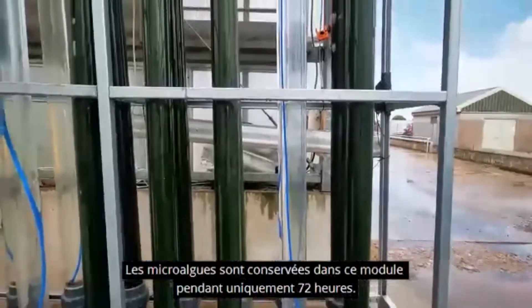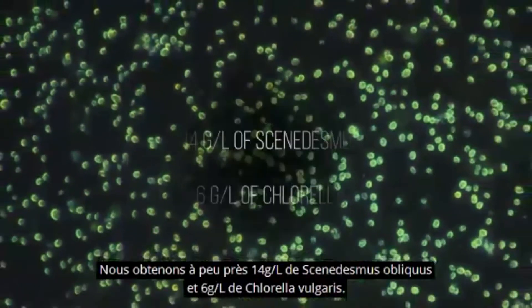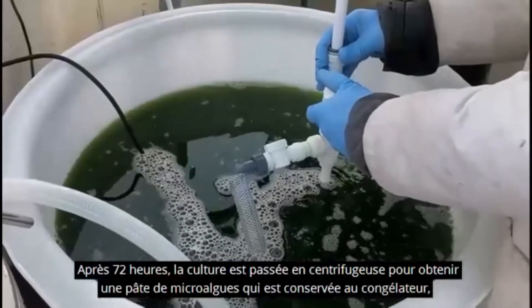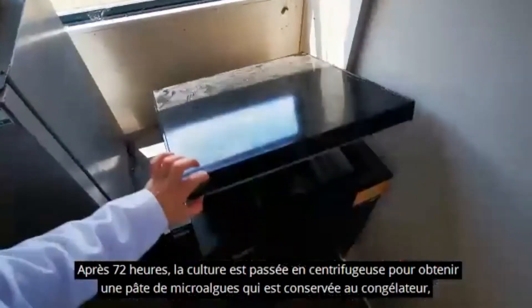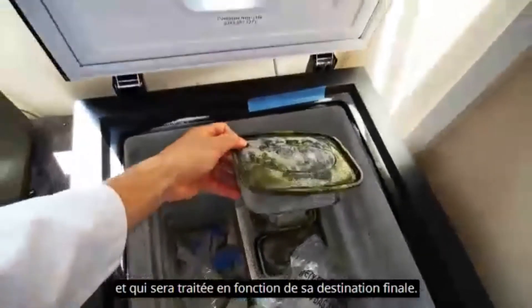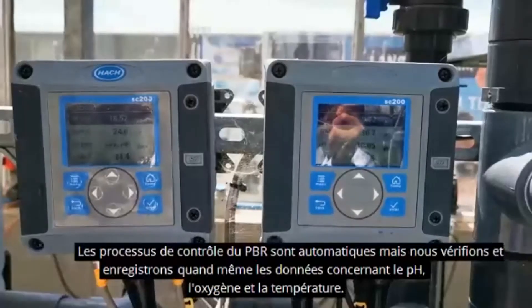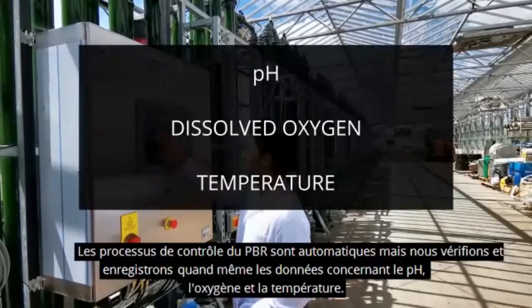The microalgae are only kept in the mixotrophic module for 72 hours. We obtain around 14 grams per litre of Scenedesmus and around 6 grams per litre of Chlorella. After 72 hours, the culture is passed through the centrifuge to obtain the microalgae paste, which is stored in the freezer and then processed according to the final destination. We also make daily routine controls, taking a sample from the PBR. Although the control process of the PBR is automatic, we check and record the data of pH, dissolved oxygen, and temperature.